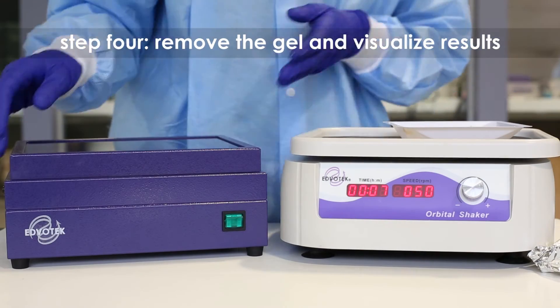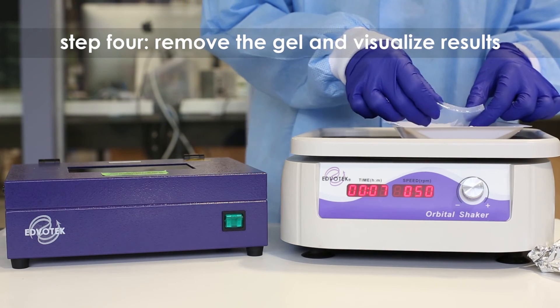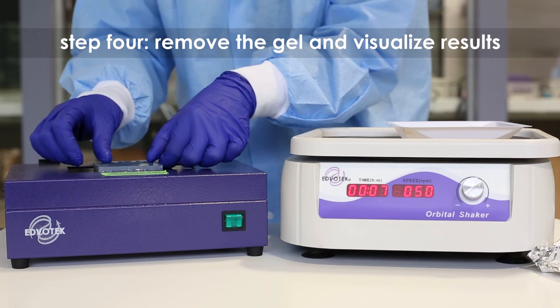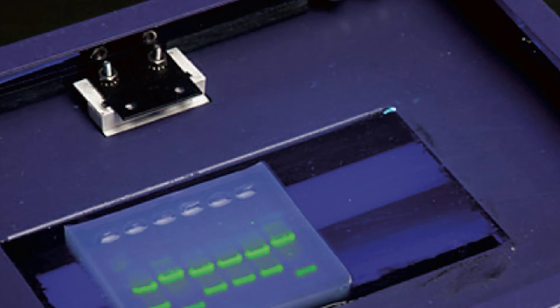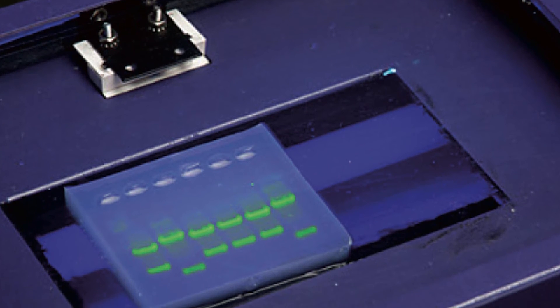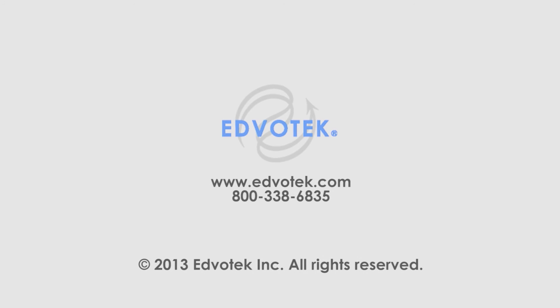Step 4. Remove the gel from the staining solution and visualize the results using a UV transilluminator. The DNA bands will appear bright green against a dark background.